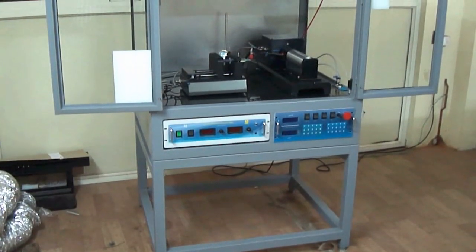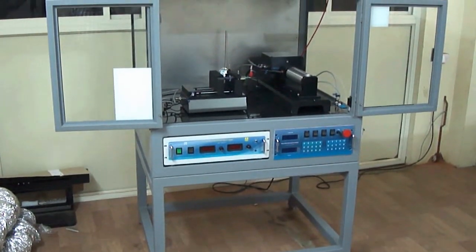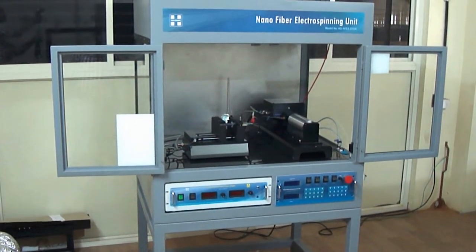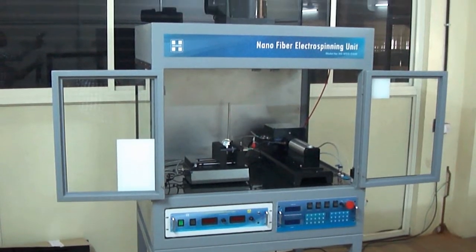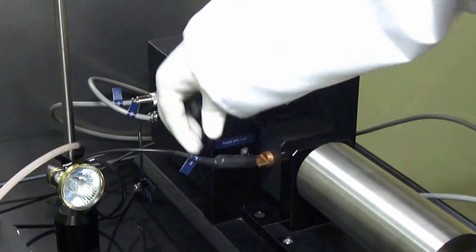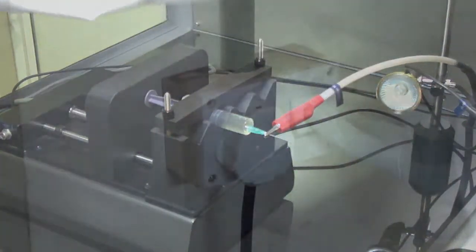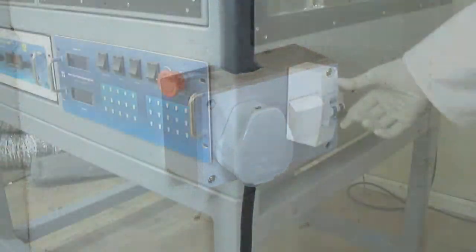A stationary target and rotating mandrels of six different diameters are supplied along with the unit. HOMARC's syringe pump renders a smooth and uninterrupted flow, enabling uniform spinning.